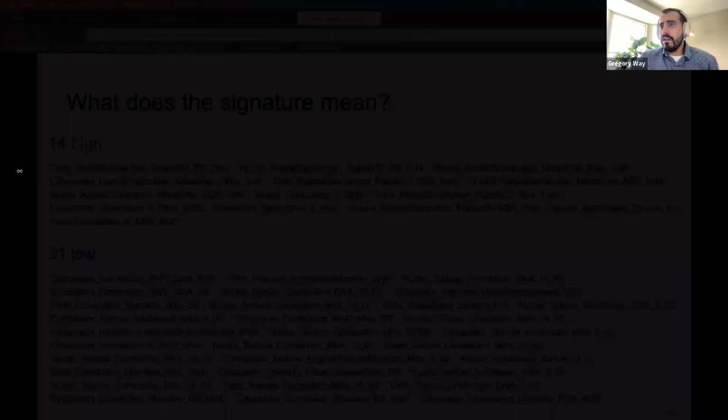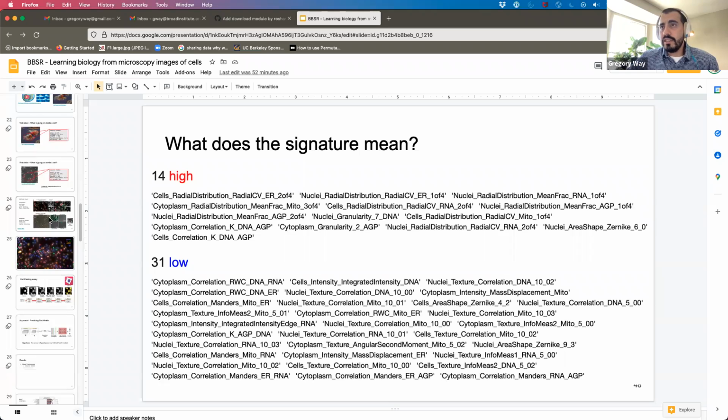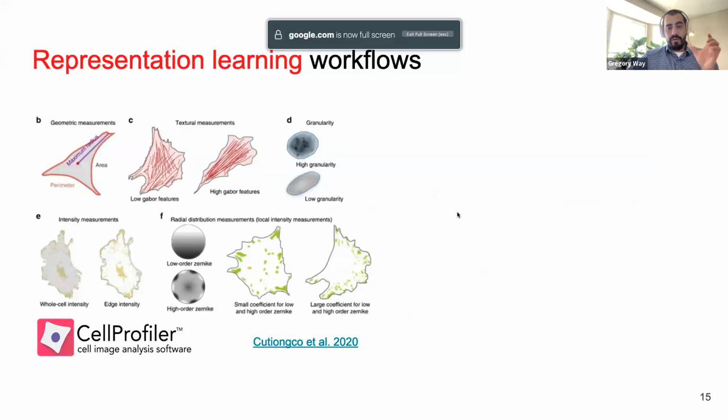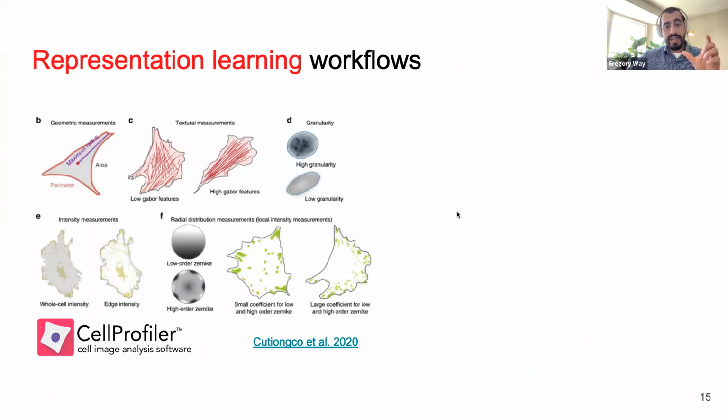Yeah, I have a slide earlier here that describes this in better detail. So CellProfiler will look at a segmentation mask of a single cell image. It segments, well, you have to tell it to do it, but it segments the nuclei and the cytoplasm. And it's going to measure a whole bunch of these so-called hand-engineered features. So it's going to measure perimeter, area, texture-based features like granularity. It's going to measure intensity across the different individual channels in the specified compartment.